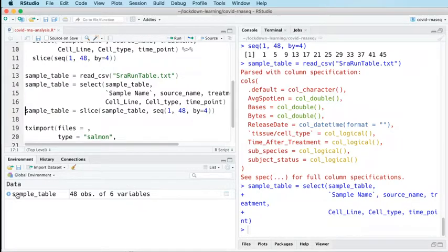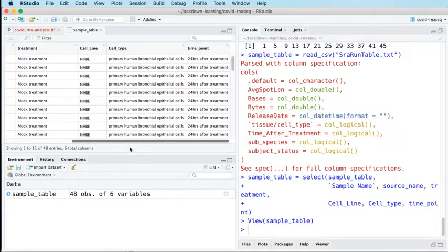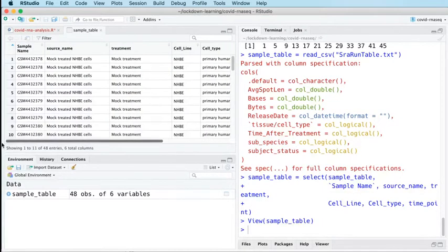If we have a look at this as it is at the moment, you'll see that every group of 4 rows in a row are identical to one another. So if you look across these rows, there's nothing different about them. Every single one of the 6 columns has the same data in each of those 4 rows. So we just need one of those 4 rows.